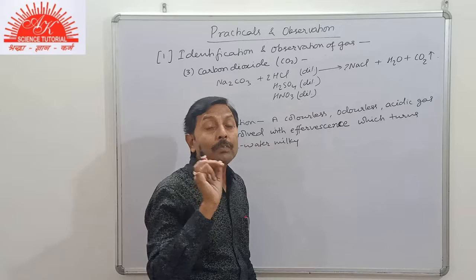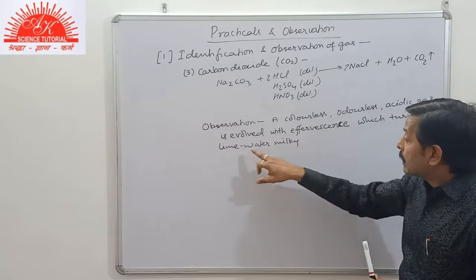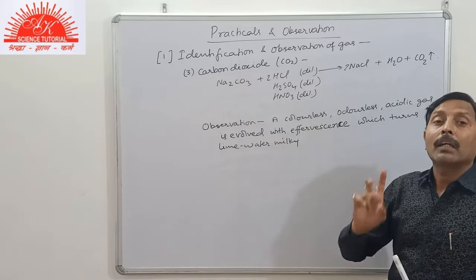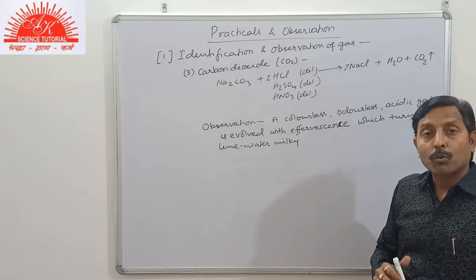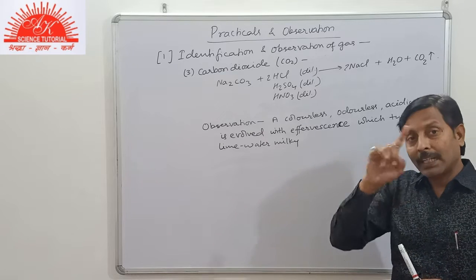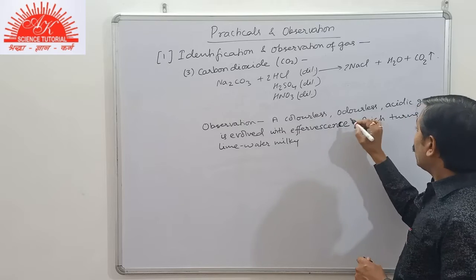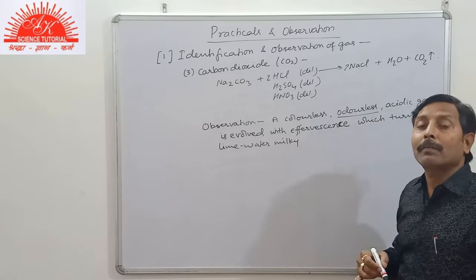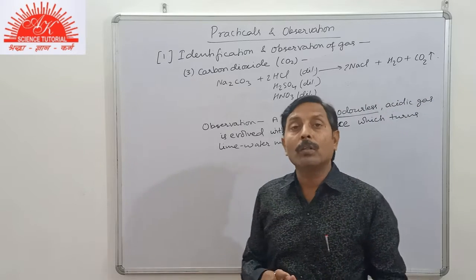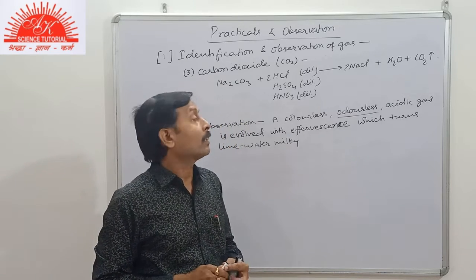But as I have told you, this test is also shared by sulfur dioxide. So we must write another part which will distinguish it from SO2. Although the smell can distinguish it, because SO2 has the smell of burning sulfur.